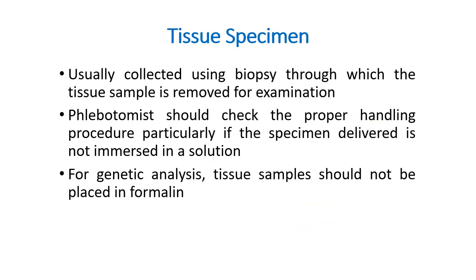Tapos, tissue specimens naman para sa biopsy. So, the tissue sample should not be placed in a formalin. The phlebotomist should check the proper handling procedures, particularly if the specimen delivered is not immersed in a solution.